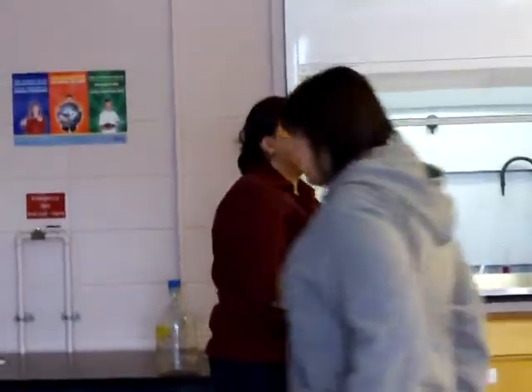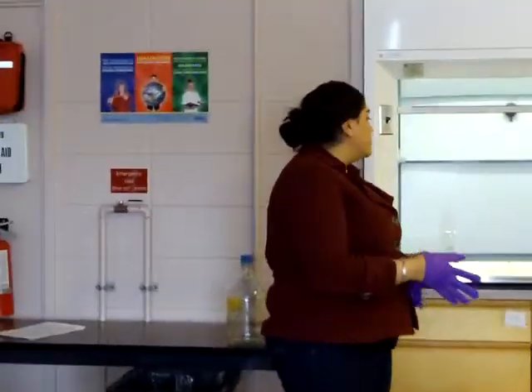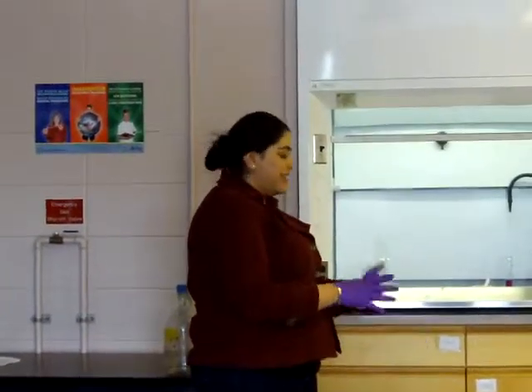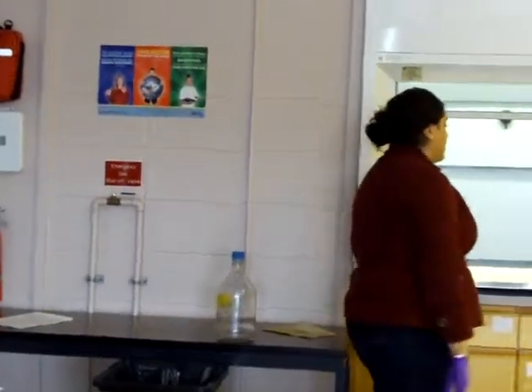I would recommend, before you do this, that you test it out several times, because the first few times it didn't actually work. I learned that in order for it to work, I had to crush it up very finely and make a little bowl. And it does stain your hands, which is why I'm wearing gloves. It stained my hands multiple times. You can gather around if you want to.